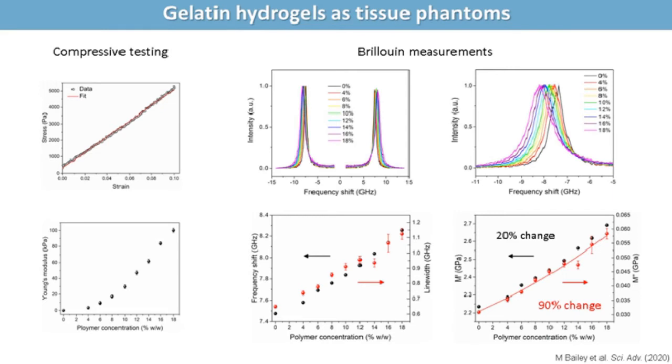So the most significant changes here are in the line width of the peak. So it's very important to be able to retrieve the true spectral shape from the spectrum, and to measure this type of effects that are reflected in the viscosity rather than the stiffness. And this is due to the interaction between water and polymer that enables the relaxation of water dynamics at the interface to be retarded across the concentration range.